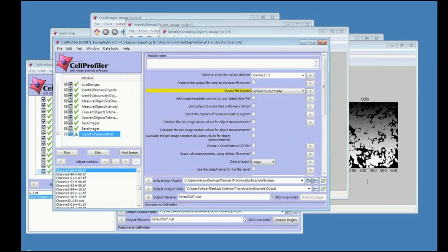Yes, it could. The way to do that is a little bit roundabout, but briefly, what the Align module does is that it can take any number of a set of images and align them all. However, the images will always be aligned to the first one in the group. So for a time course, what we usually do is pick one image out of your set. Let's say you have a movie or your time course split up as an image sequence. Oftentimes we'll pick the first one, kind of arbitrarily, just because we need to register against something. So we'll pick the first image as the input for the Align module.